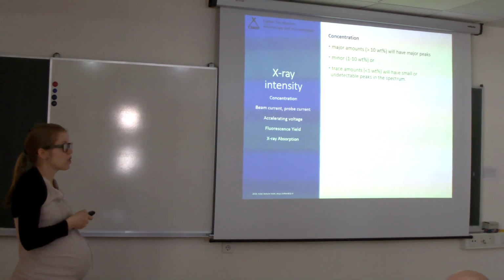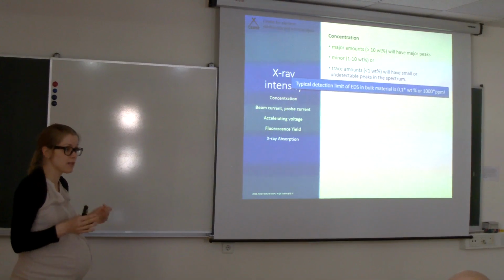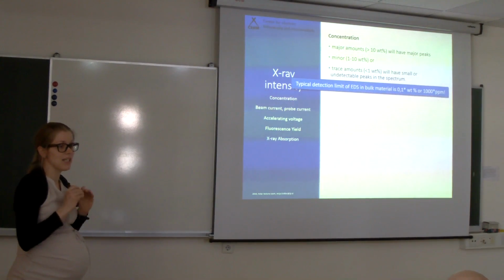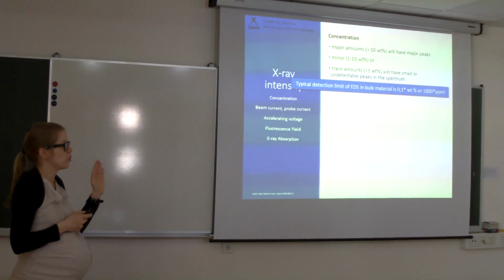So the concentration: typically in EDS in bulk material, if you have a flat surface, you can detect 1000 ppm, but this is like the limit, yeah? So it's really hard to get that. So you would go to WDS, it would be easier.